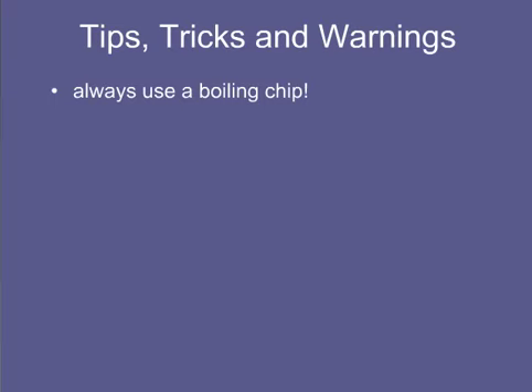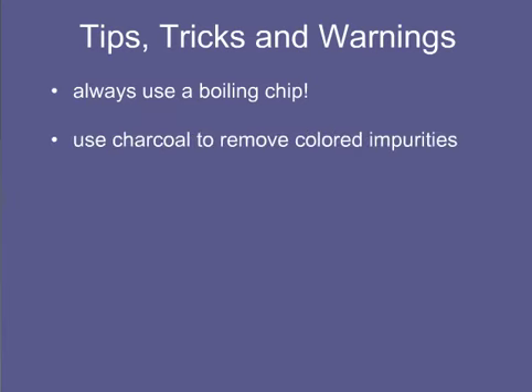If the crystallization solution is colored and the solid being crystallized is colorless, activated charcoal may be used to remove colored impurities. A small amount of charcoal is added to the warm solution and it is gently heated again. Do not add charcoal to a hot solution as it will cause rapid boiling and frothing.